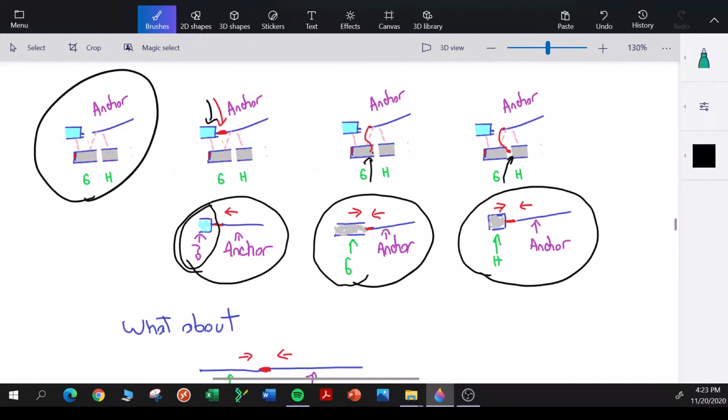And remember, we're analyzing millions of cells. So all of these different fused fragments could exist in our DNA solution.